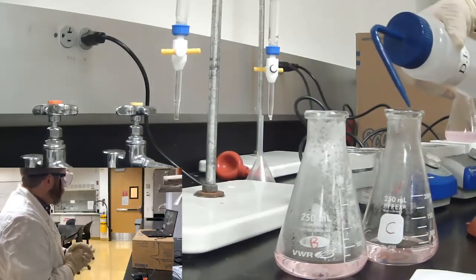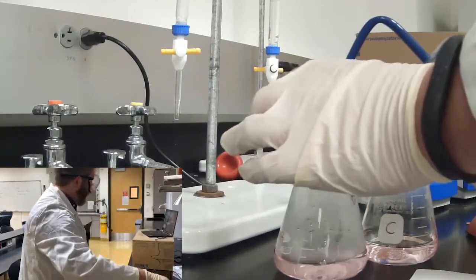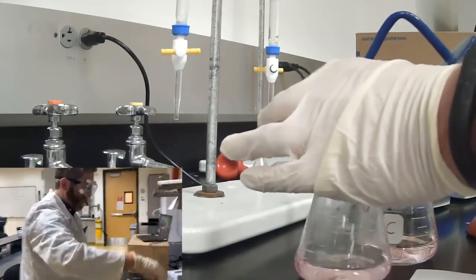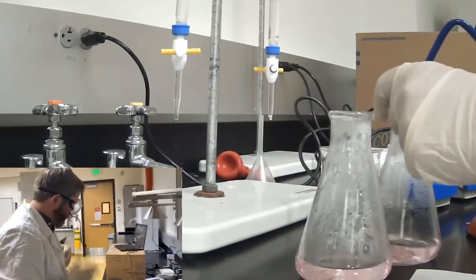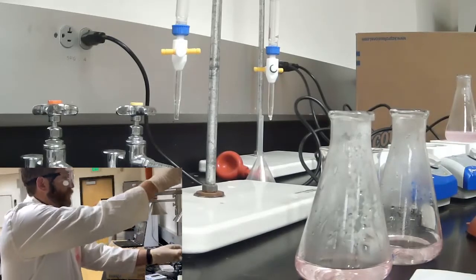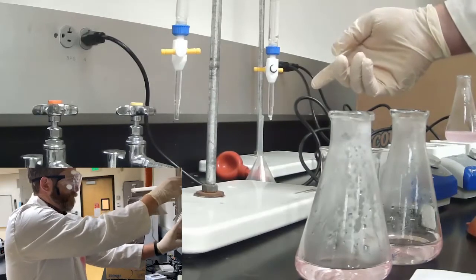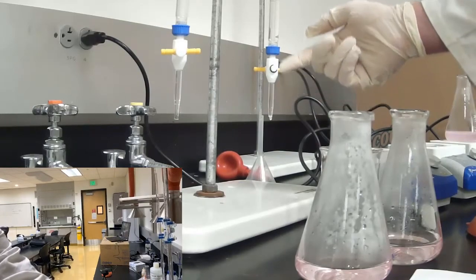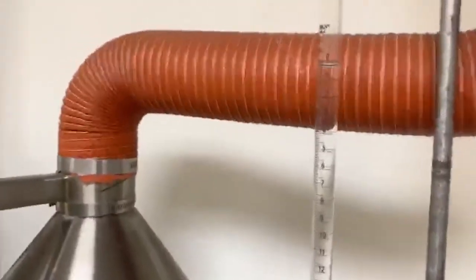All right, now for our titrations, we have these burettes that we have filled with our standardized 0.100 molar sodium hydroxide solution. So we've already gone ahead and filled them, and we need to measure, first of all, our starting points. So when we look at our burette, we are looking for the initial reading here in the top of the burette.